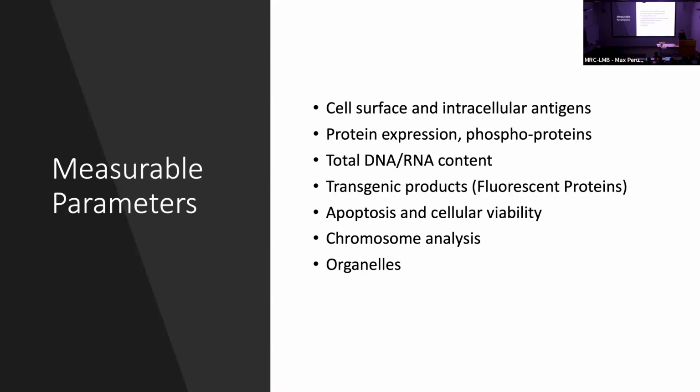And we can also do chromosome analysis in the facility. We did a lot of this for Julian Zale and Jason Chin's lab, where we essentially purified chromosomes for downstream analysis. And as well, you can do any kind of organelle marking, for example, mitochondria.